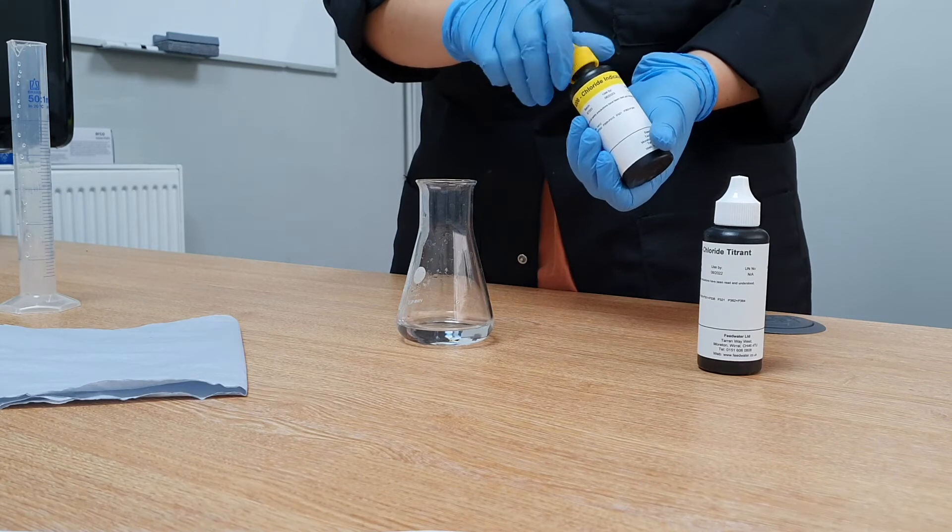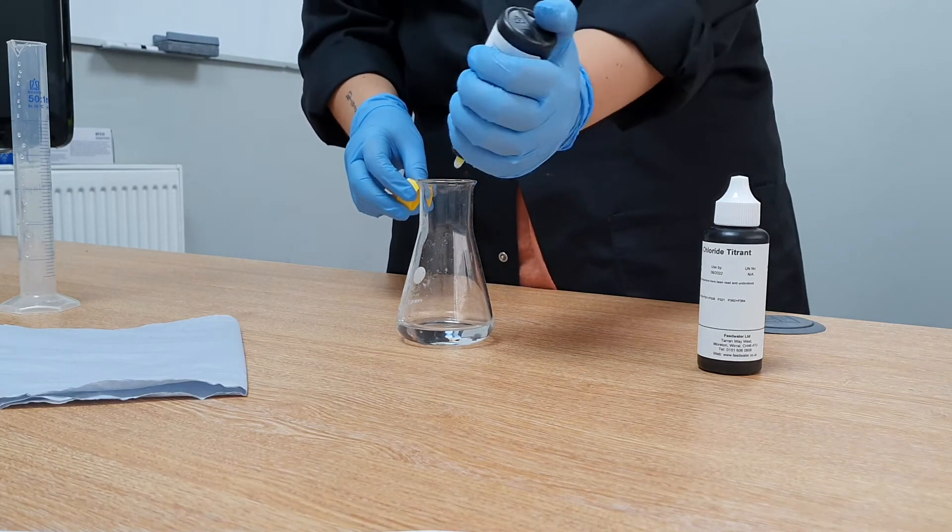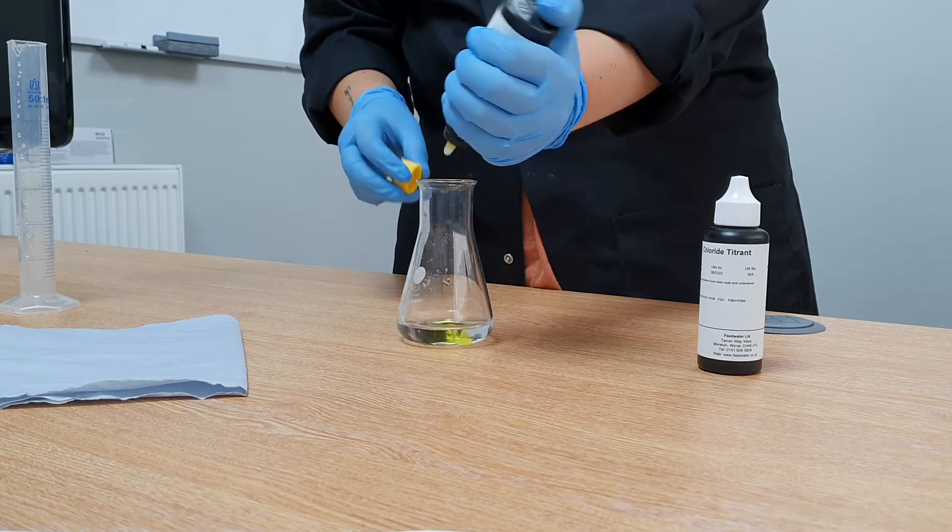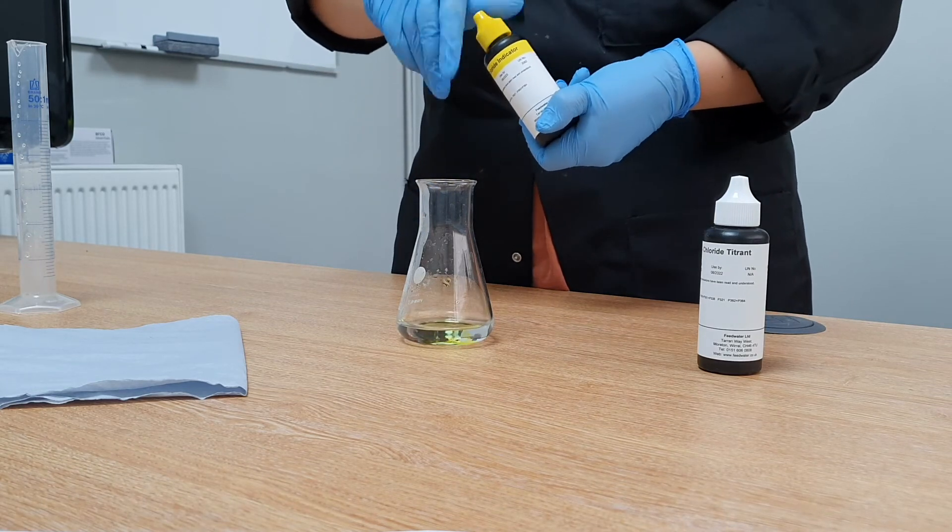Add 5 drops of chloride indicator solution to the sample and swirl to mix. The sample will turn yellow.